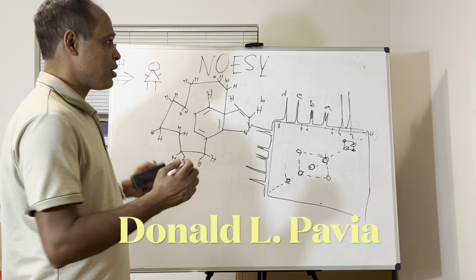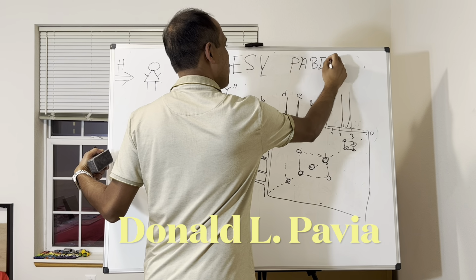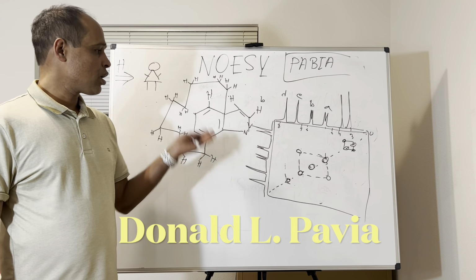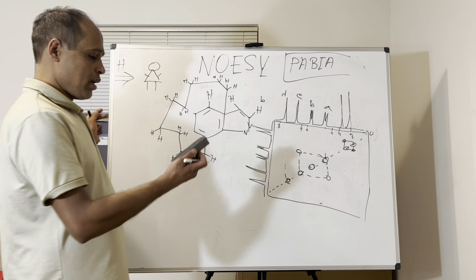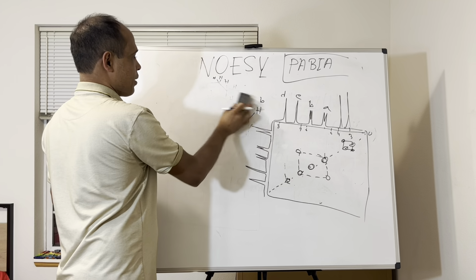Pavia, P-A-V-I-A, most probably P-A-B-I-A. This is the writer, so you can Google it. His book is really good to understand those 2D NMR and the basic information, like theoretical background, everything. I'm just showing you the application, okay? Let's do now the HSQC.